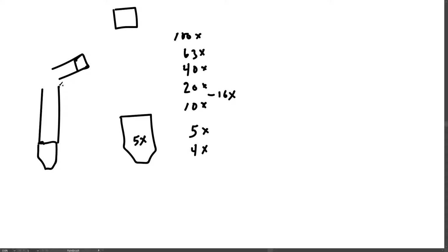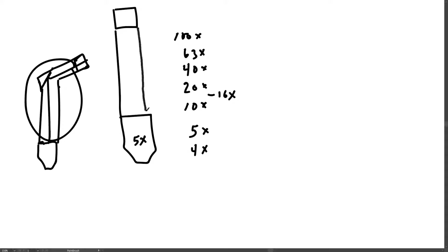The microscope is shaped like this so that you can comfortably sit at a desk and look through the eyepieces. So there's a mirror here, and the light information reflects off of the mirror and then ultimately into your eye. But this is just air in here. So you could have the eyepiece here, and just a tube of air, and those are the two optical components, the eyepiece and the microscope objective.